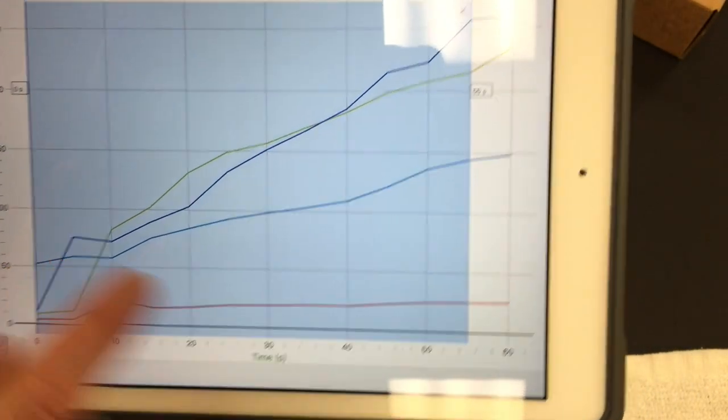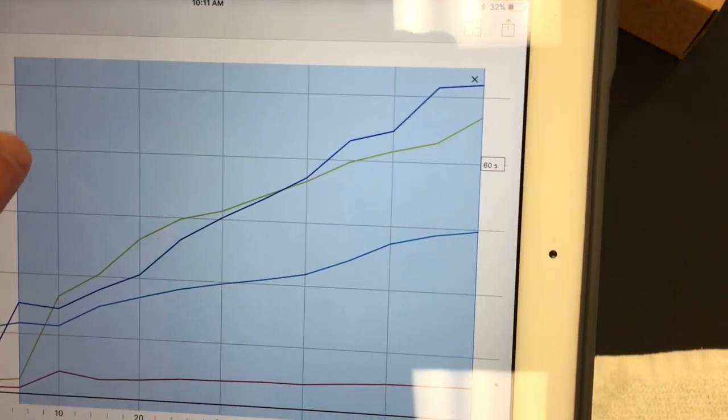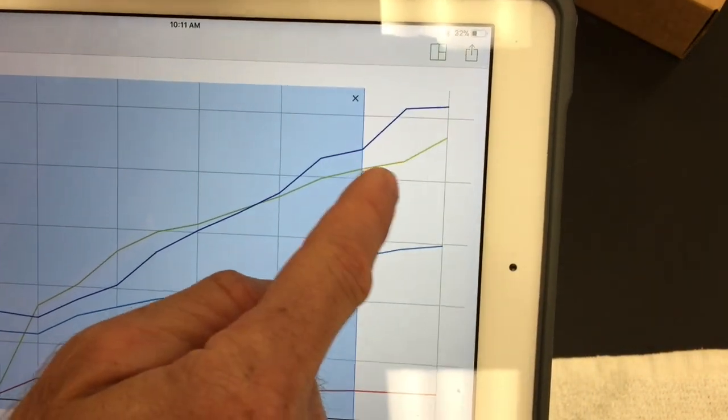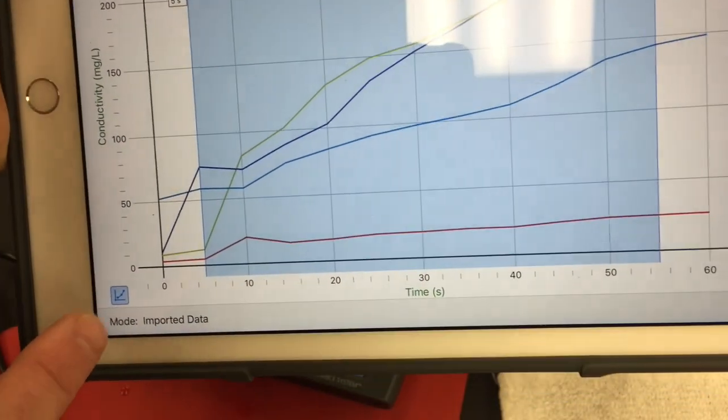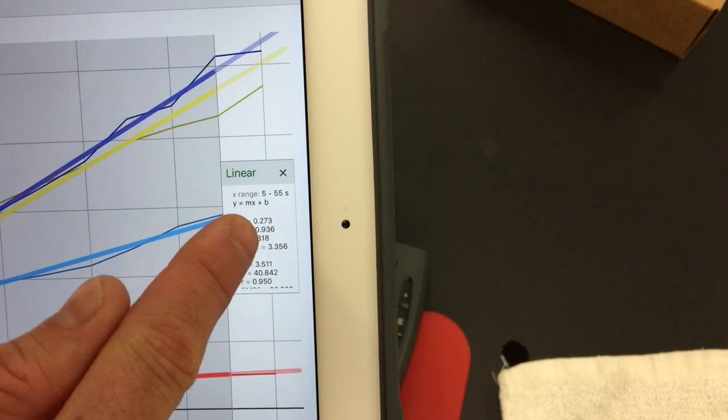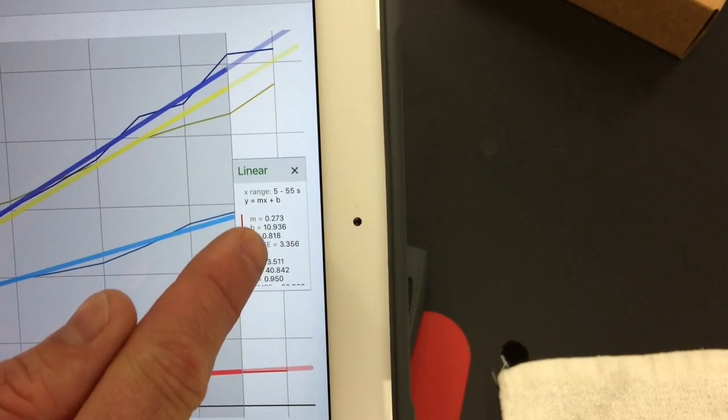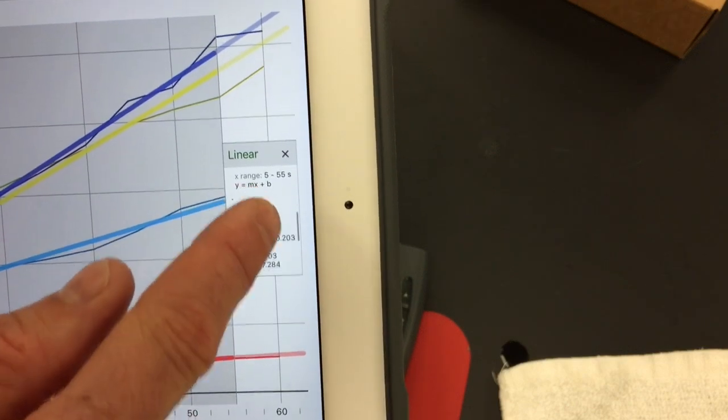You're going to need the slope of those lines. Select parts of the graph that you think are relevant. In the bottom left, select the graph, apply curve fit, and then in the equation line y equals mx plus b, m is the slope or the rate. Then you can make a data table showing what the rate is for each of the salt solutions.